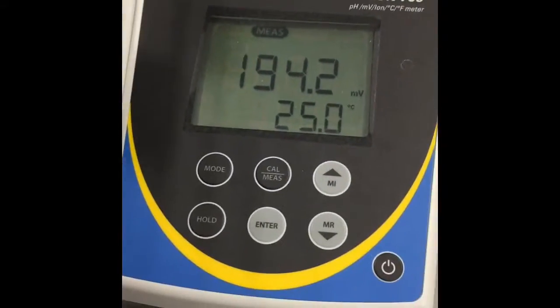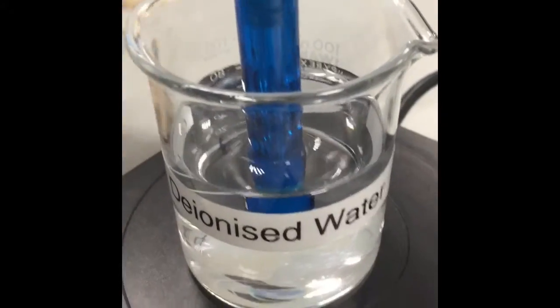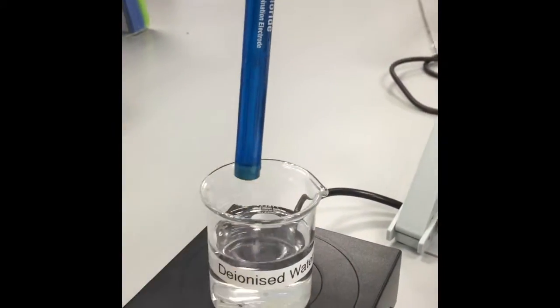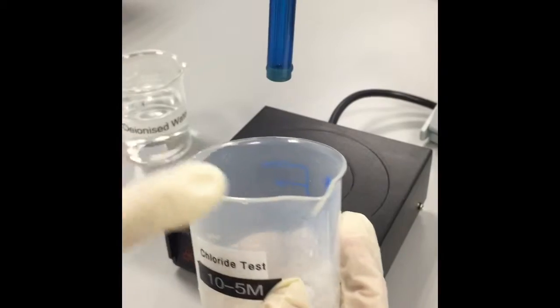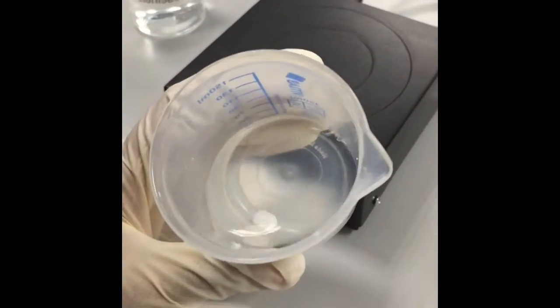This machine will be measuring your pH, and over here is your electrode. You'll be using a chloride electrode for your sodium chloride, and for your calcium nitrate please use a nitrate electrode. Before you start measuring the solutions, please use Kimwipes and wipe the electrode carefully, and place the magnetic stirrer bar into the beakers for 10 to the power negative 5, negative 4 and negative 3.